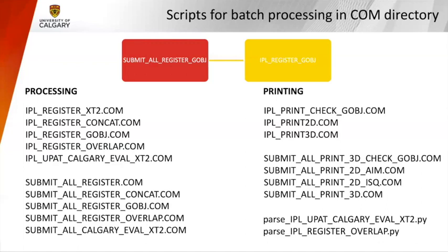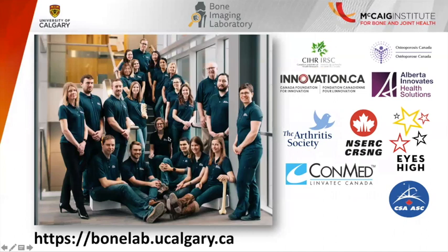There's somewhat of a parallel here too. Some of these IPL scripts can be used for looking at either AIMs or ISQs. So it's still submit all print 2D, and both of them will use this script here. So it's close. And then these are completely separate. So that's the end of those slides.